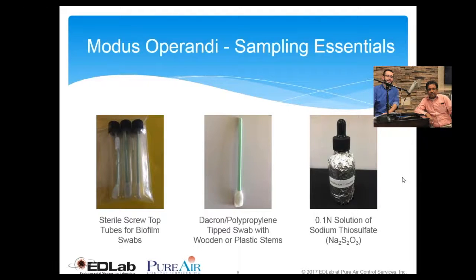if you have a known Legionella problem or routinely if you have treated, then we also need some stabilizer in order to get some information.